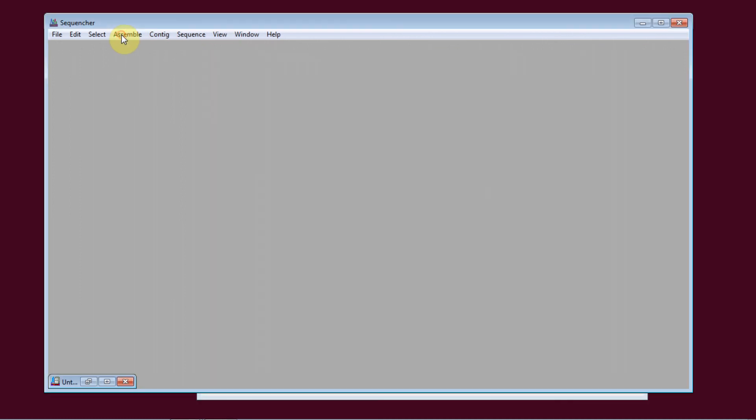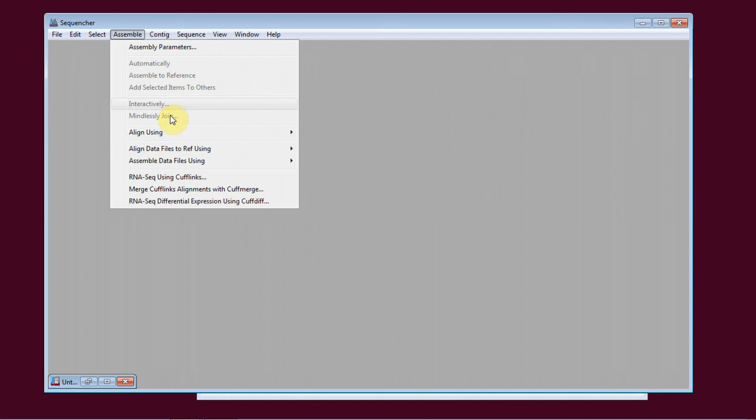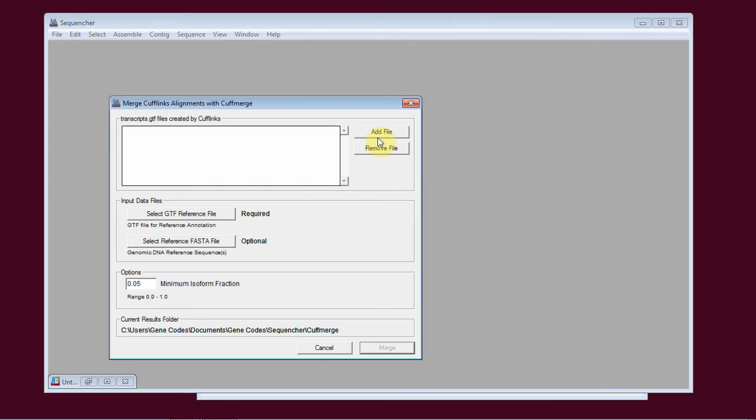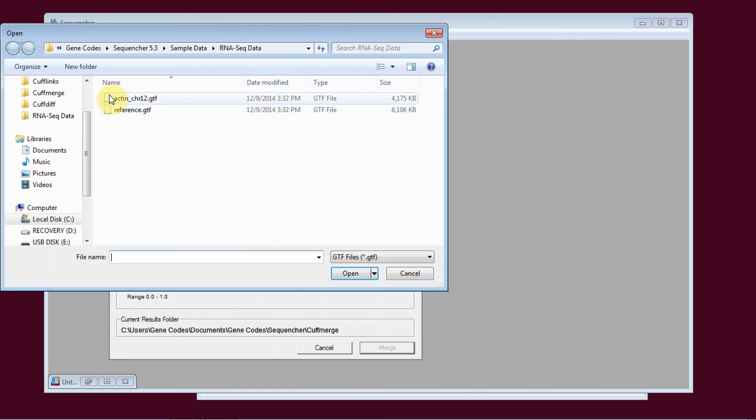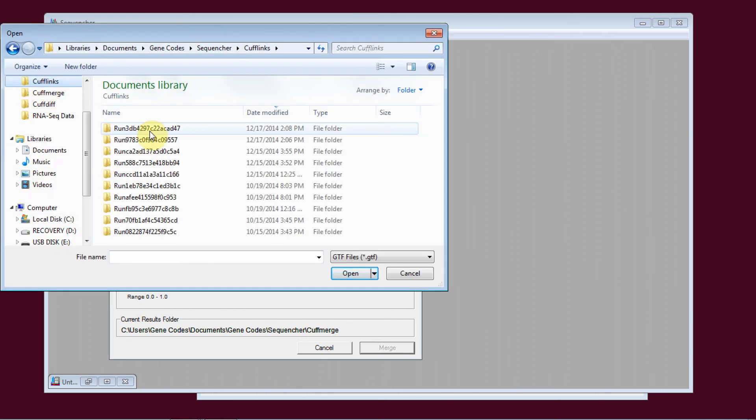I'll click on Assemble, Merge CuffLinks Alignments with CuffMerge. I'll select my transcripts files. Now I know that these two most recent runs were the ones that I'm interested in.